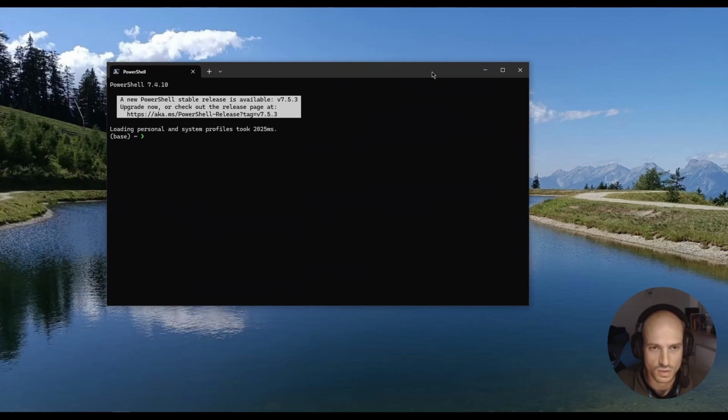So the first thing is obviously to run SpotMAX. For that, we need to use the terminal. That's probably the only time that you will interact with the terminal, except for confirming a few details when you actually run the analysis. I'm using the PowerShell. I'm on Windows, but you can run SpotMAX on Windows, Mac, or Linux. You will have a different terminal.